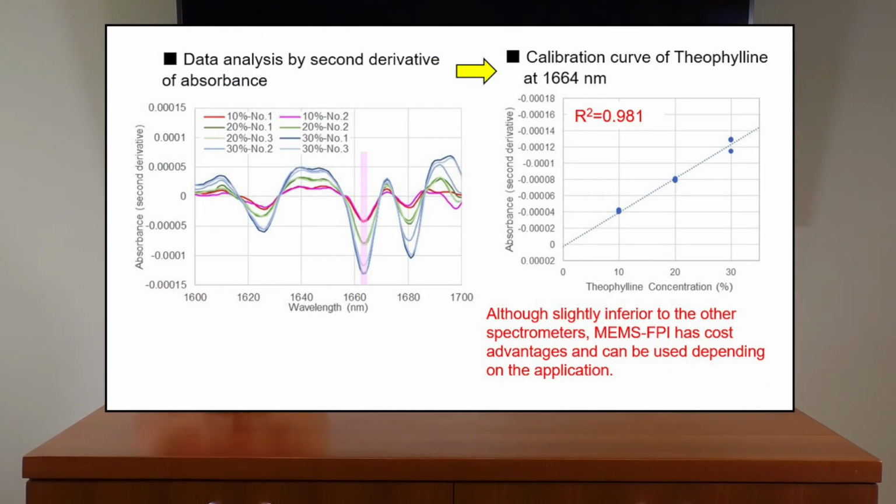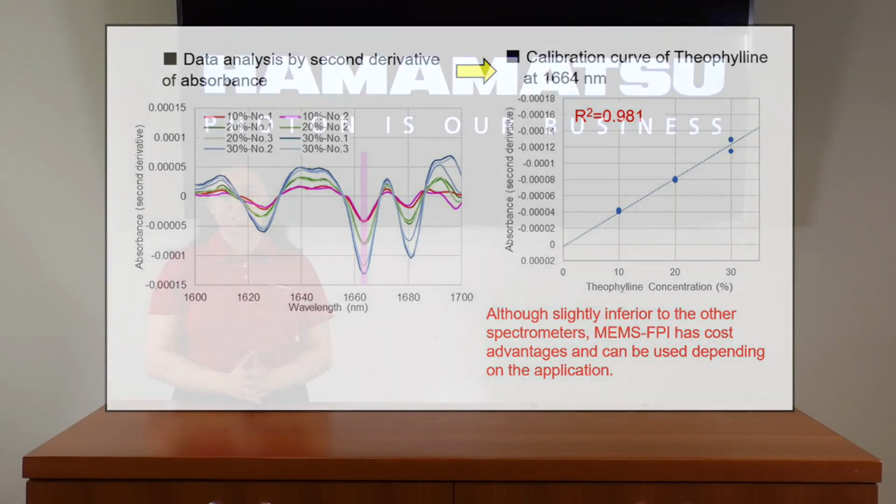This process can be useful for various measurements which, at a glance, may not appear useful. In these cases, observable improvements can be achieved by applying a second derivative.